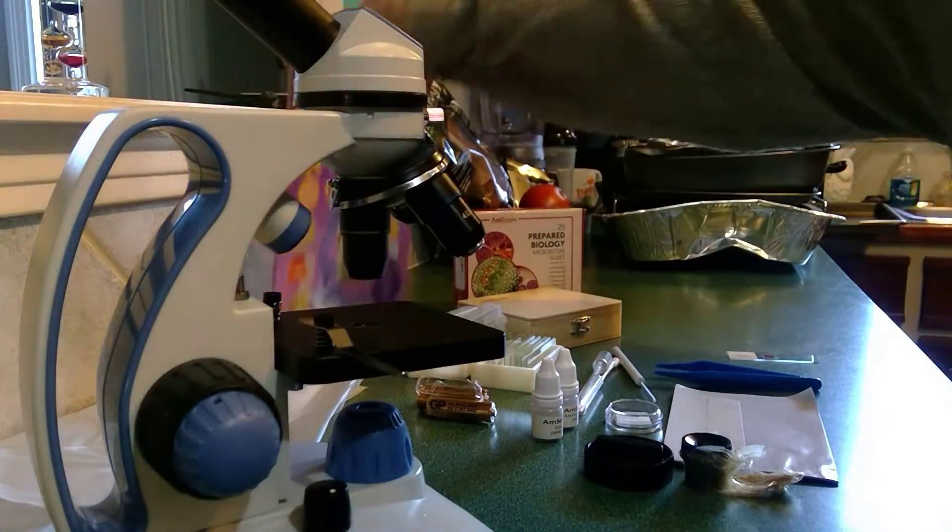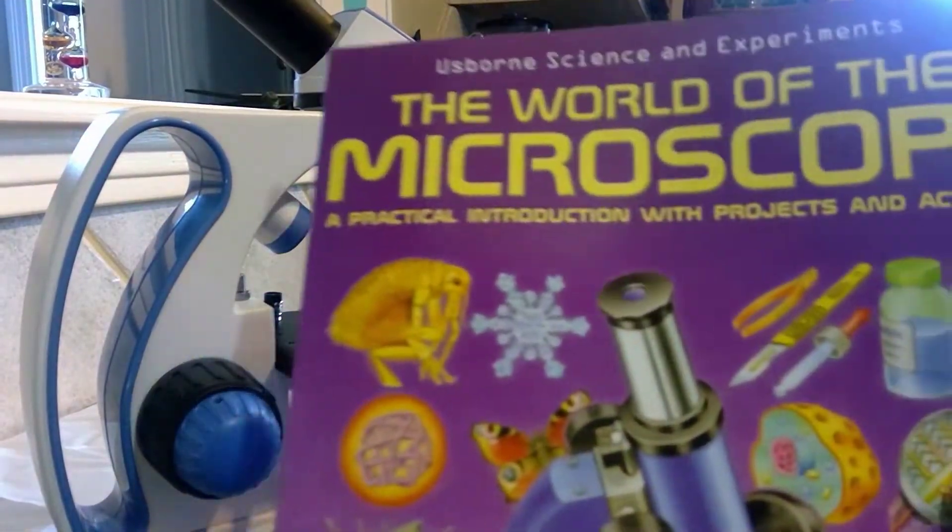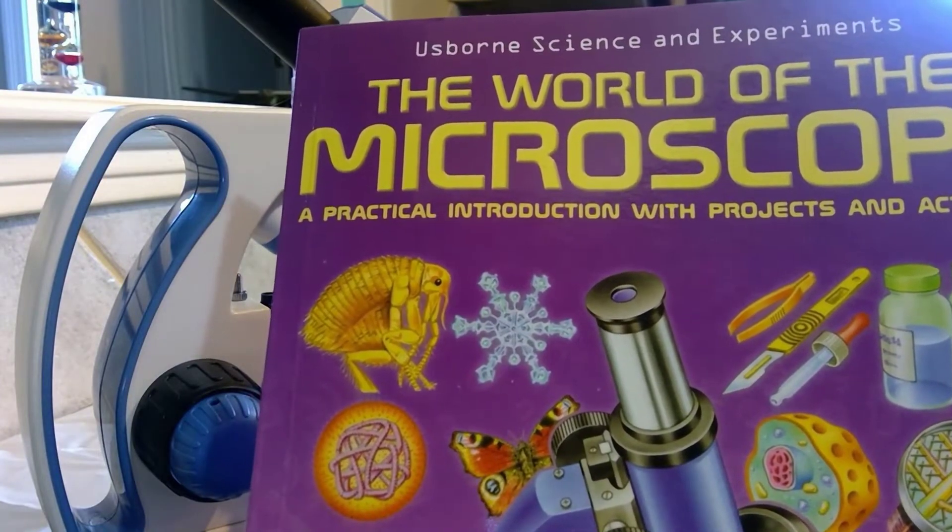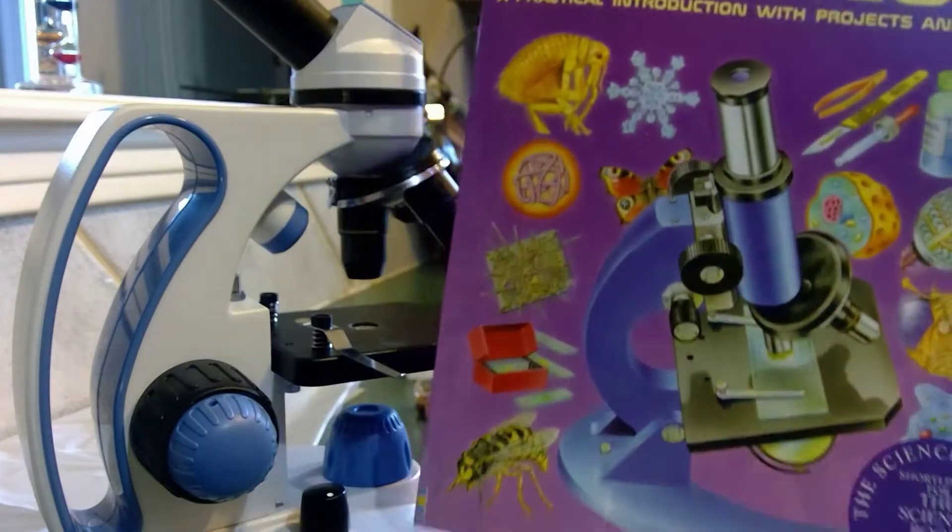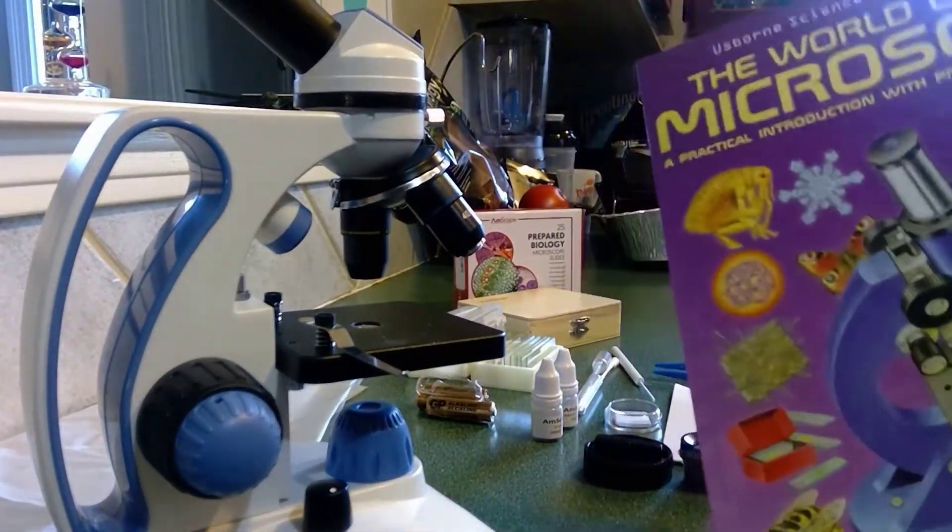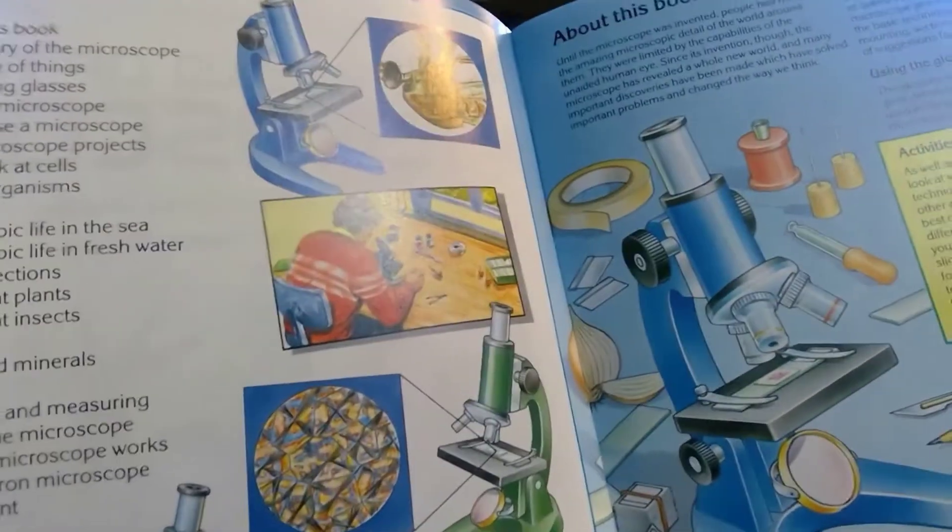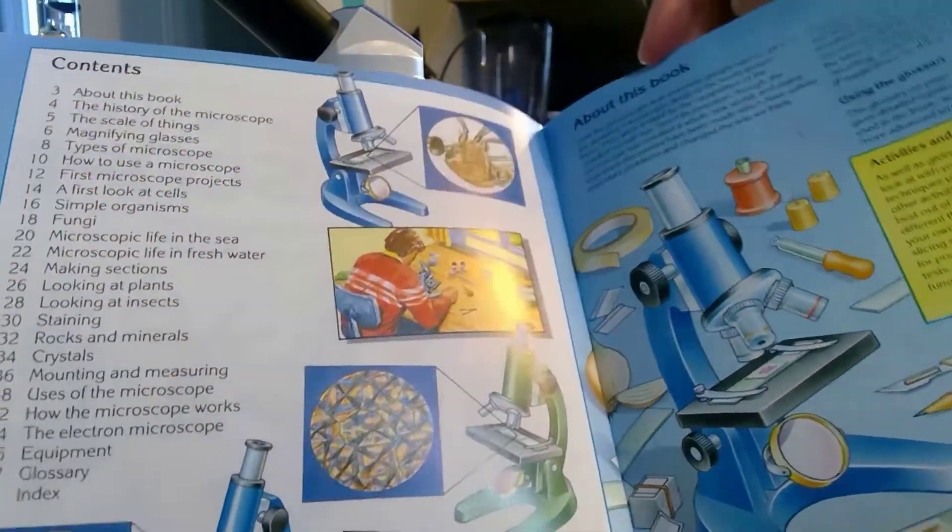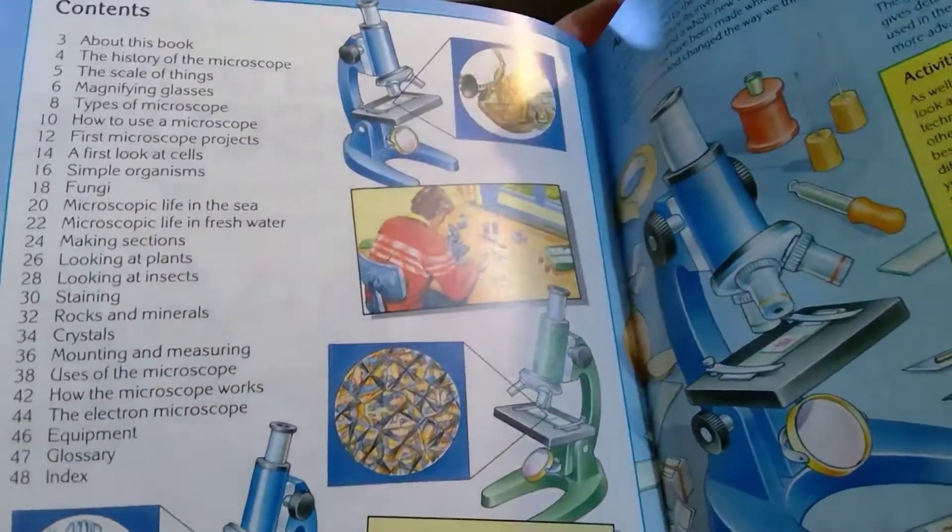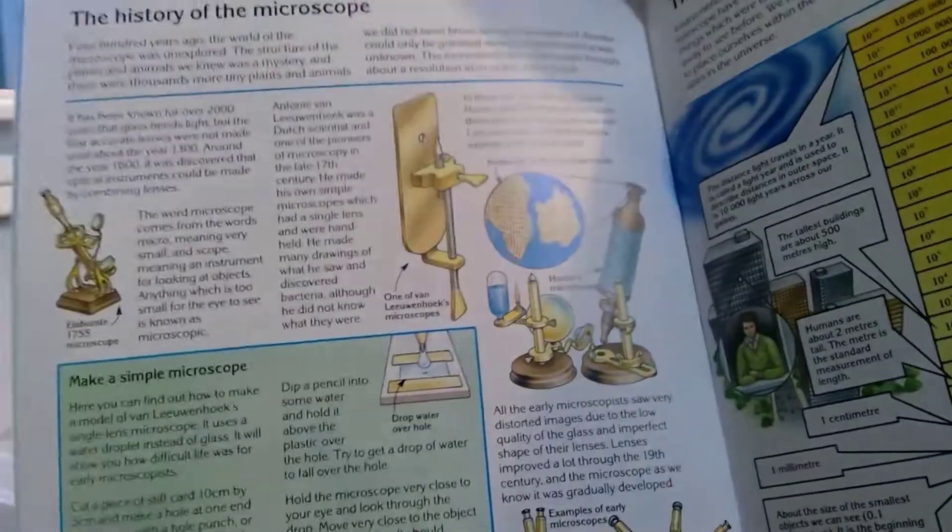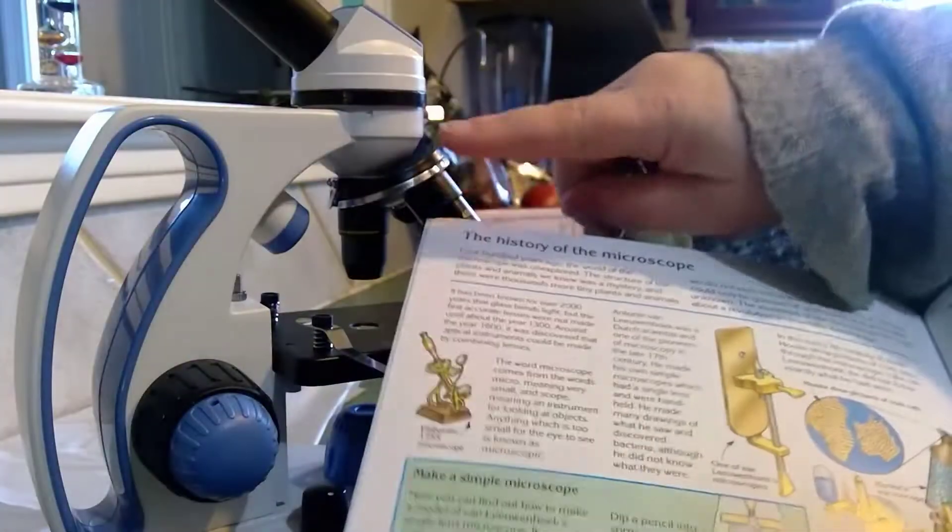It comes with this Usborne science and experiments book, The World of Microscopes. This is really a great book, and it really goes in-depth about the things that you need to know about a microscope. It goes in-depth about the parts of a microscope, because I think the only thing that I've found so far with getting this microscope is that it doesn't come with instructions on how to use this specific microscope. It comes with this book, but this book isn't for this microscope.